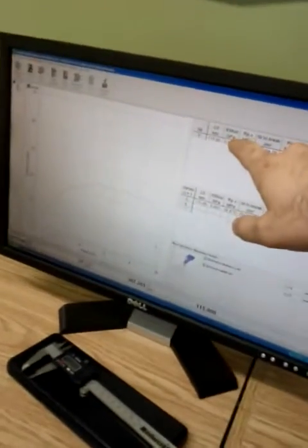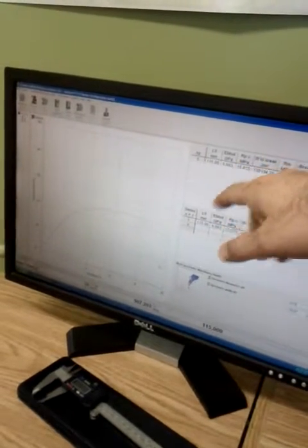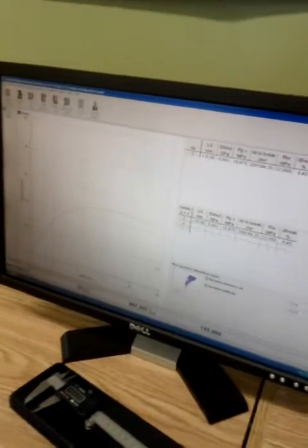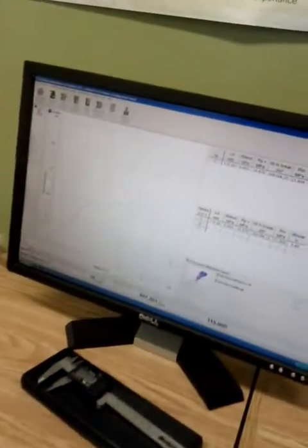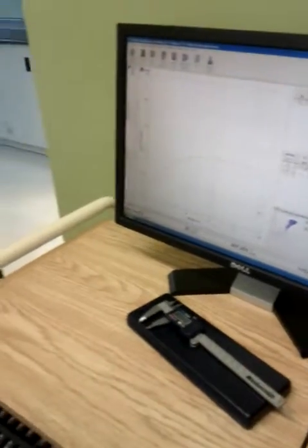So in the case of wood plastic materials, if this amount is higher or lower, which one is better if you want to compare different materials? Which parameter? Tension at the... Usually the higher is better, but it depends on what you want, because usually when resistance is higher, strain is lower. Do you want high strain or low? It depends on your applications.